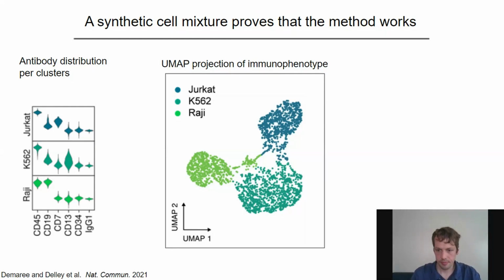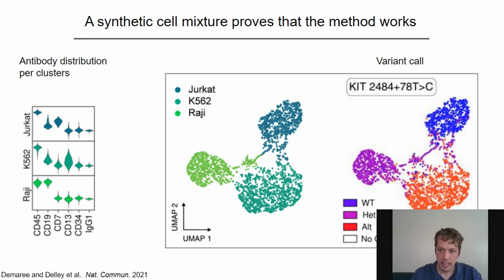as we do indeed see here. Now, in addition, since cell lines are derived from distinct patients, they inherit the genetic fingerprints of these people, and therefore we should be able to map the genotypic differences between those cells on top of this UMAP representation. And that is indeed the case.